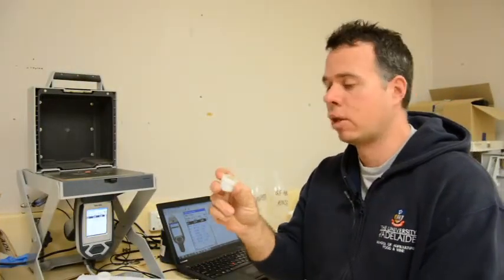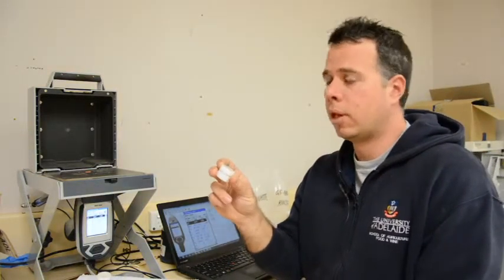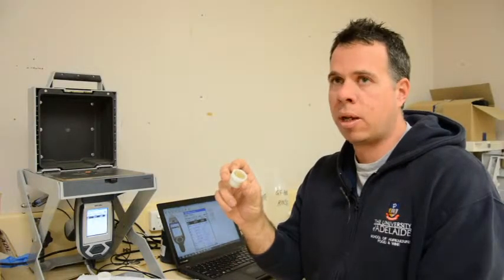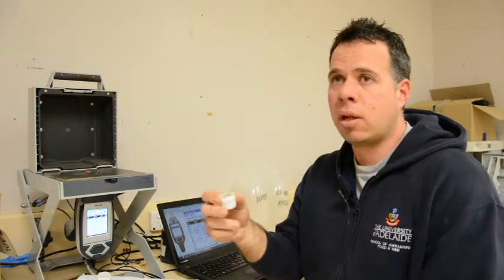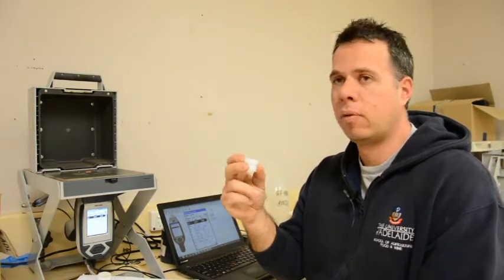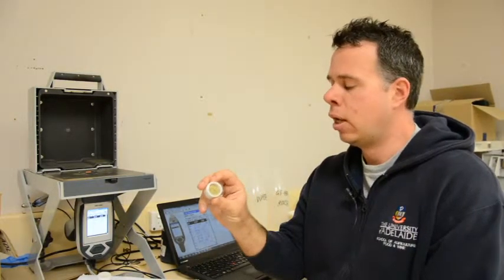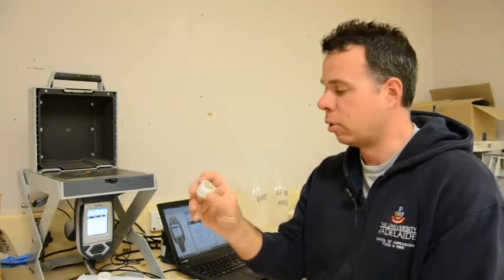The theory behind XRF is it emits X-rays to a sample. So the theory is that when we shoot this sample with X-rays, electrons from a certain element will get excited, go to a higher energy state, and then drop back down to a lower energy state, and when it does that, it actually emits a signature. Depending on how much nutrient content is in that material, it will give you back a proportionate signal. So we've been getting the signal, the counts, or a reading of ppm, which is inbuilt into the machine, and calibrating that against the acid digest, followed by an ICP measurement.